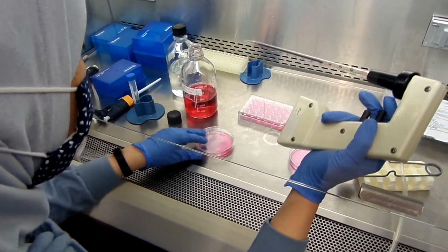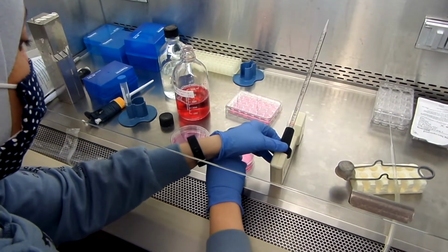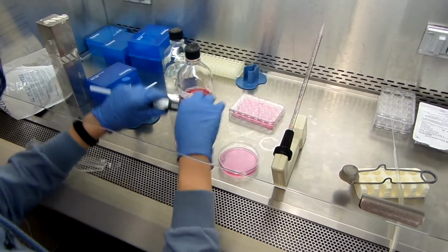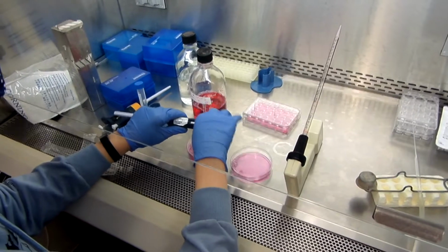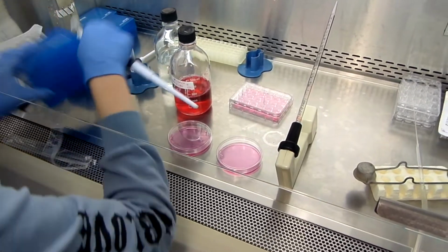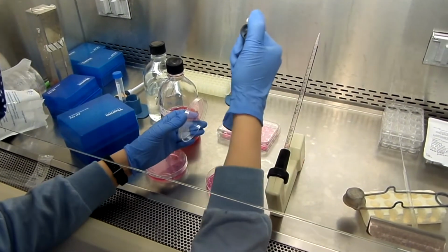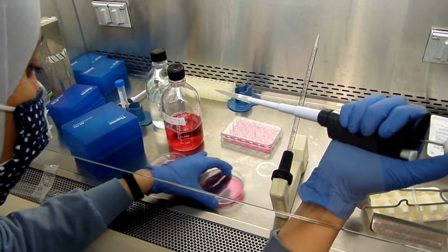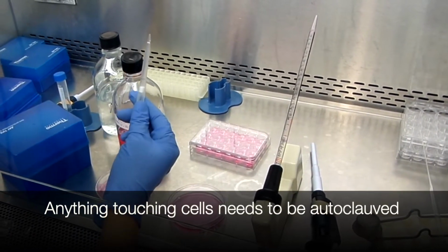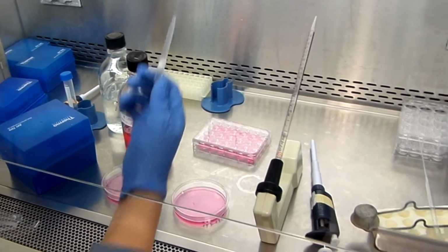Okay. So I have this plate, the new one. I will add 1 ml of the old plate that has 10 mL of floating cells. This tip cannot go to the regular trash. It has to go to the trash bag that will later be autoclaved because it has cells.